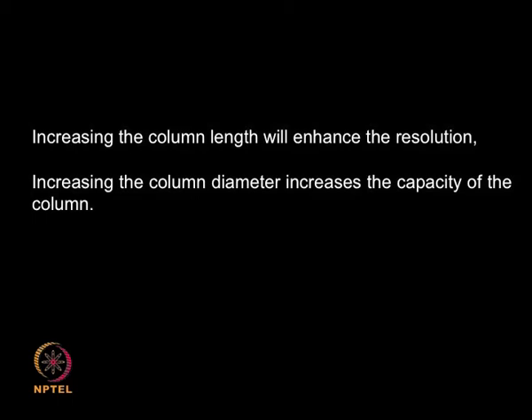Increasing the column length will enhance the resolution. Increasing the column diameter will increase the capacity of the column. So if I want to increase capacity, I will increase the column diameter. If I want to increase the column resolution, I will increase the column length. But if you have too long a column, there is going to be diffusion and spreading taking place. So the peaks may be separating, but the entire chromatogram will be very dispersed and there will be an overlap.